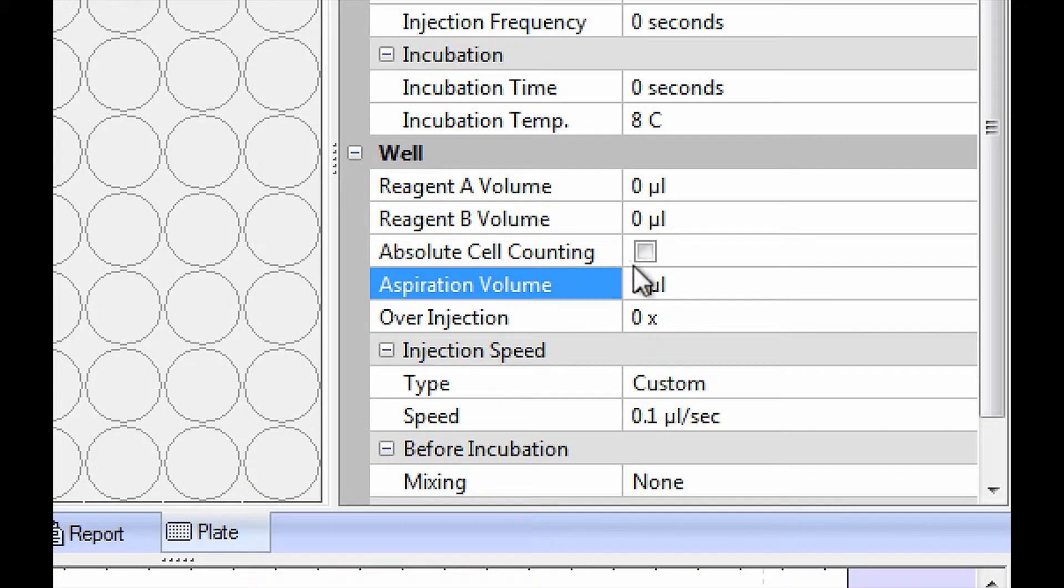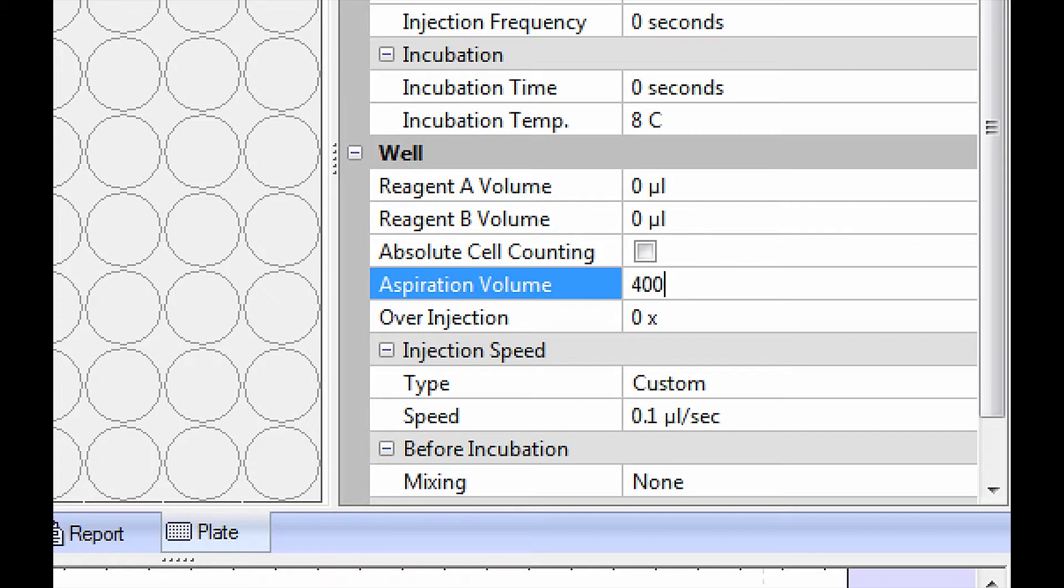The A600 boasts a truly unmatched dynamic range. Users can aspirate between 5 and 400 microliters with incredible accuracy.